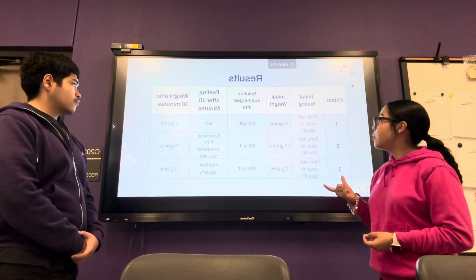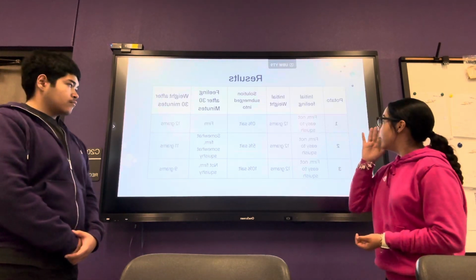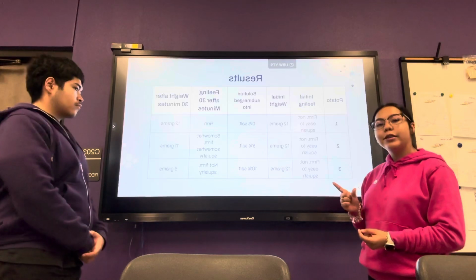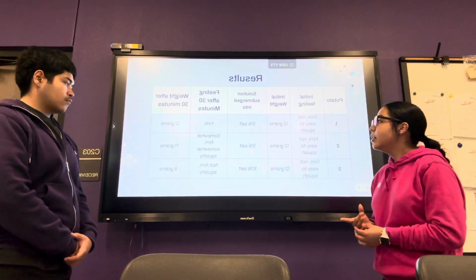The feeling of potato 1 stayed the exact same. It was really firm, we couldn't squish it. After sitting in the salt, potato 2 was somewhat firm and a little bit squishy. It wasn't as squishy though as potato 3, which was soaked in the 10% salt.